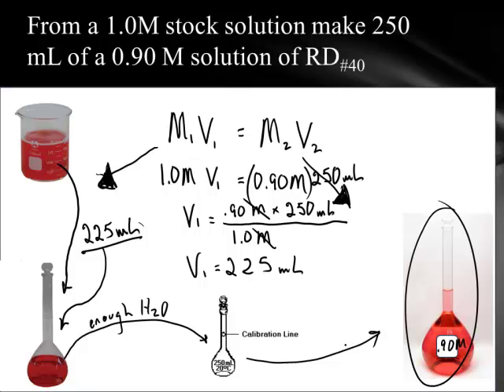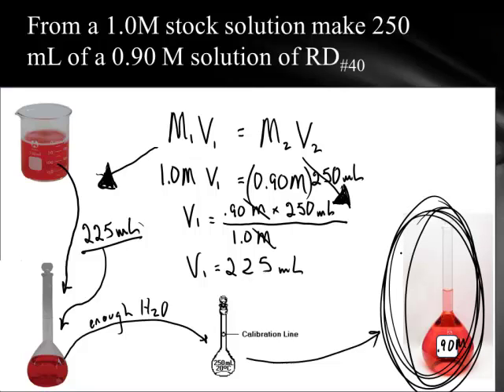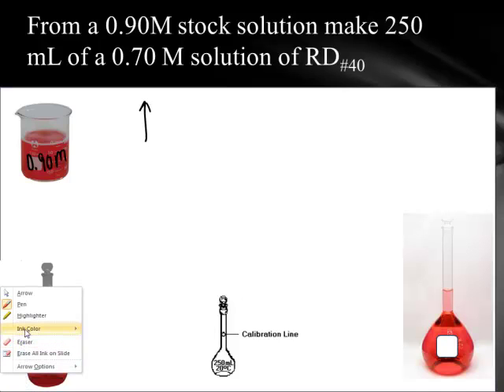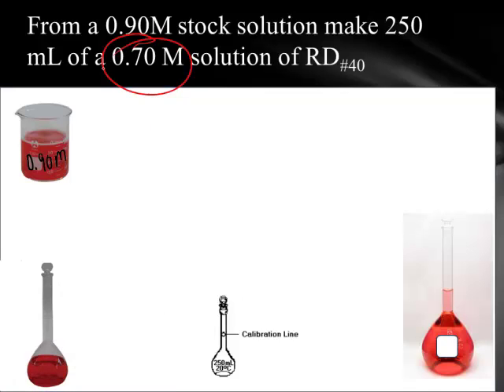Let's look at another example of this problem. What we're actually going to do is take this 0.9 molar solution and pour it into this beaker right here. This 0.90 molar solution becomes my new stock solution. In this problem, I'm starting with 0.9 molar, and I want to make — you can see it right up there — I want to make 0.7 molar.